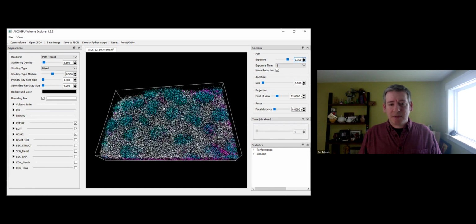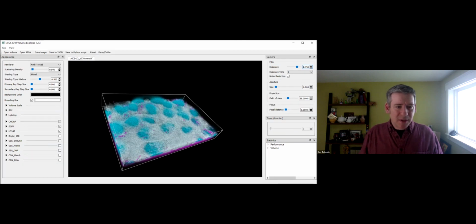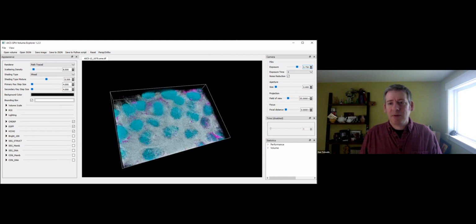This is an image that you can download from the Cell Feature Explorer website. I'm going to stretch my user interface to widen it a little bit. These images that we provide have 9 built-in channels. 4 of the channels are raw data from the microscope, and the other 5 are derived data, segmentation data essentially. When the image comes in right off the bat, we try to apply some thresholding settings to it.